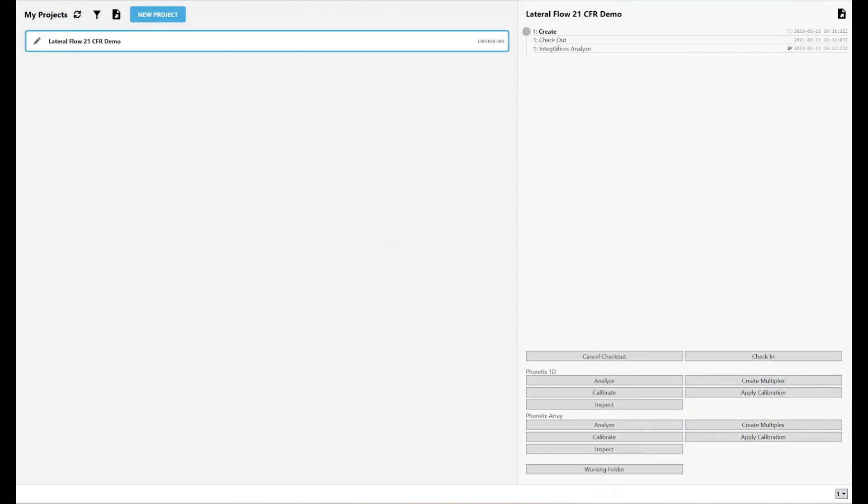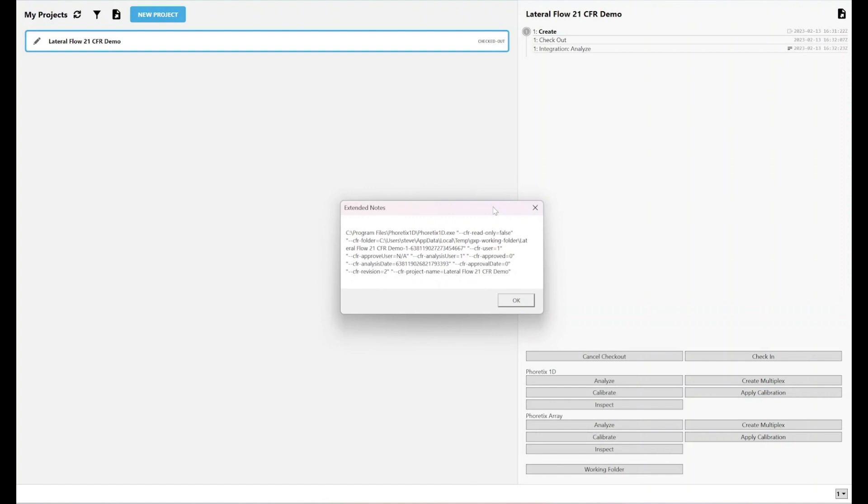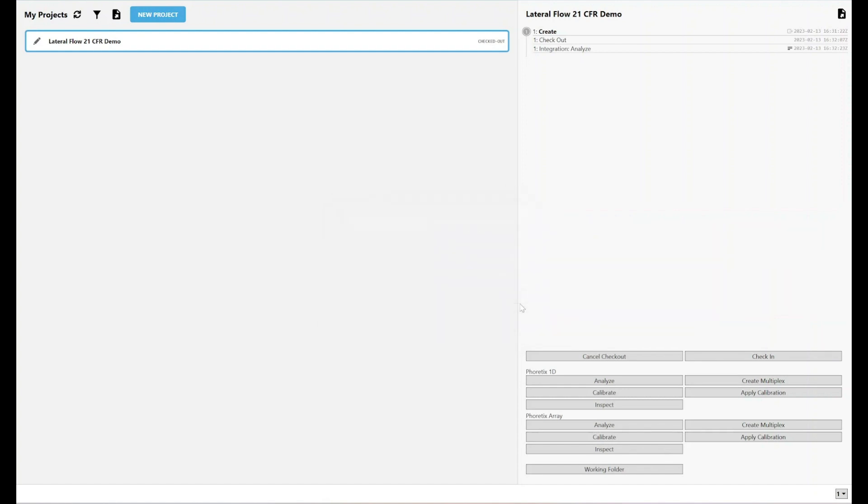As you can see, I've now got a couple of steps that are in my audit trail that weren't there previously. The software has read that I've checked out the project and I've done an analysis on it. If I click this button here, these are the extended notes. It shows that I have opened Phoretix 1D.exe. It's not in a read-only state. I've checked it out to my working folder. The user that's done it is user1.